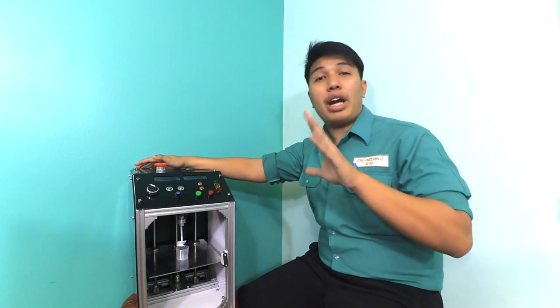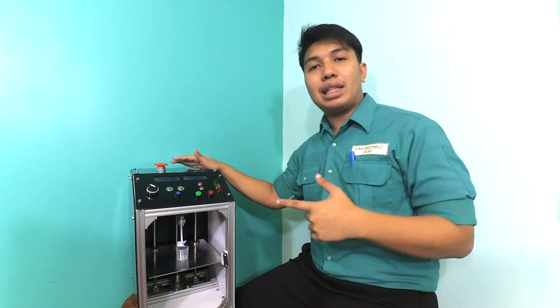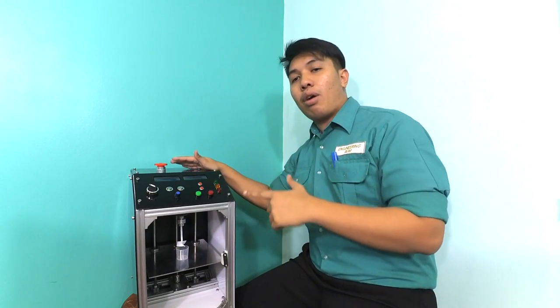Of course, everyone can use this machine. Even myself uses this machine because I am the inventor. But this machine is designed specifically for researchers to do their work, to invent new products.